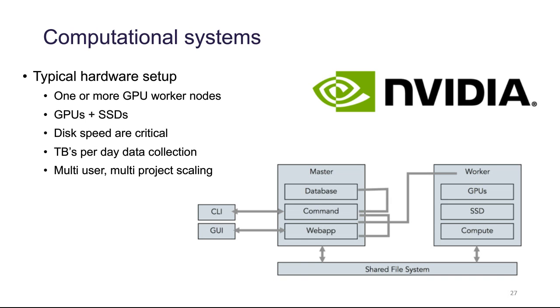For those implementing systems for CryoEM computation, it's important to note that with the latest algorithms and GPUs, reading data from storage is often the first bottleneck. To achieve the fastest and highest performance results, especially in CryoSpark, it's crucial to couple GPUs with very fast SSD disks. It's also important to have a plan or strategy to deal with the vast total amount of data that is collected and processed for CryoEM.